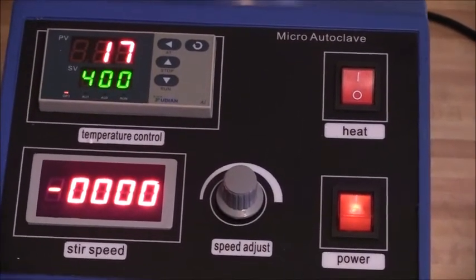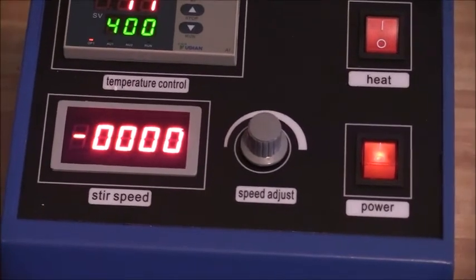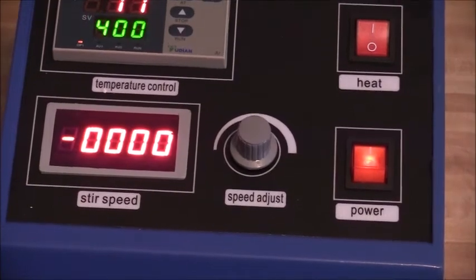The zeros that you see at the bottom of the vessel represent the revolutions per minute of the stirring mechanism. This vessel comes with a built-in magnetic stirrer.